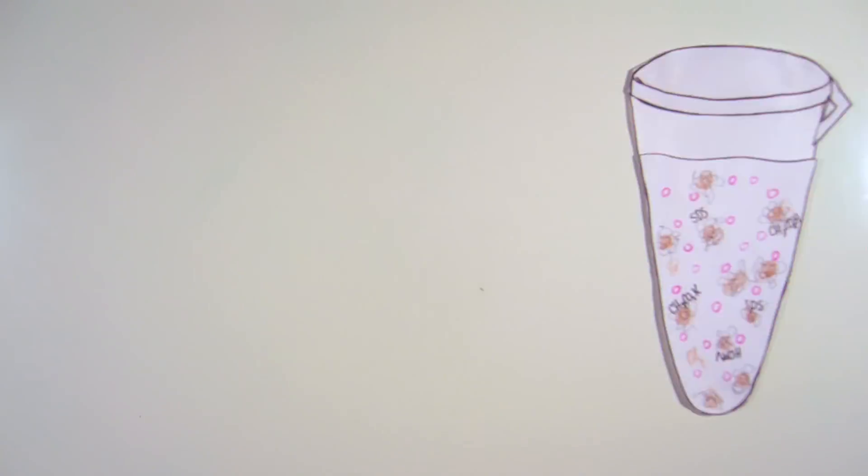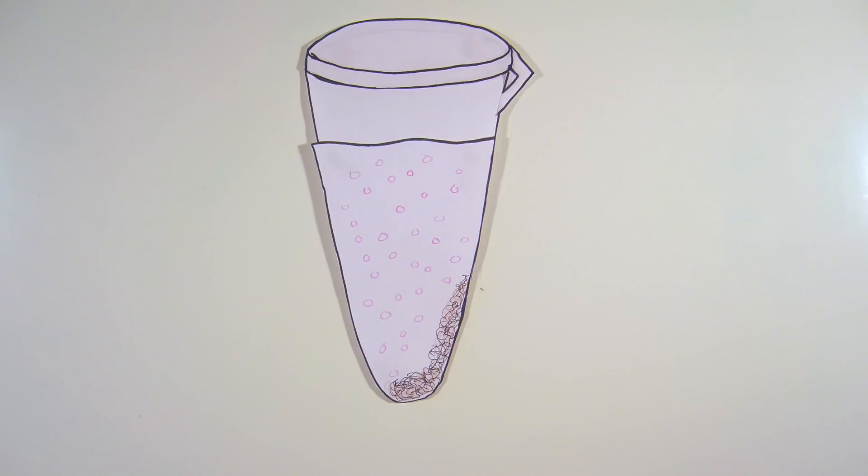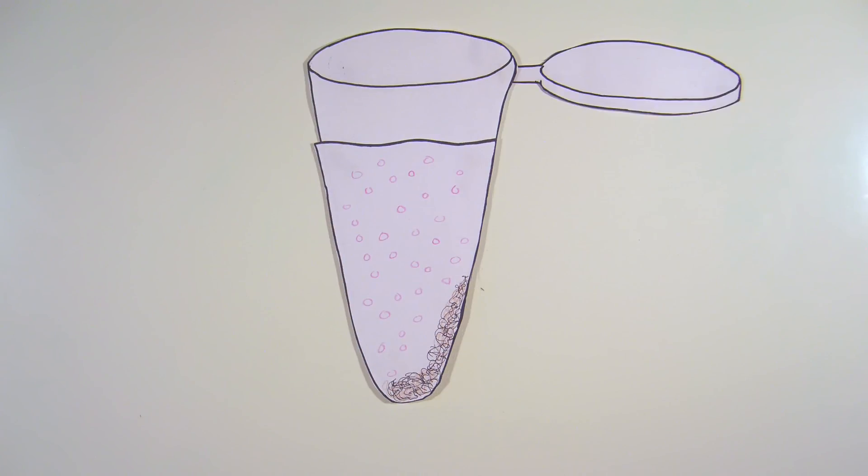The tube is centrifuged to separate the solid precipitate, which will be discarded, from the liquid supernatant.